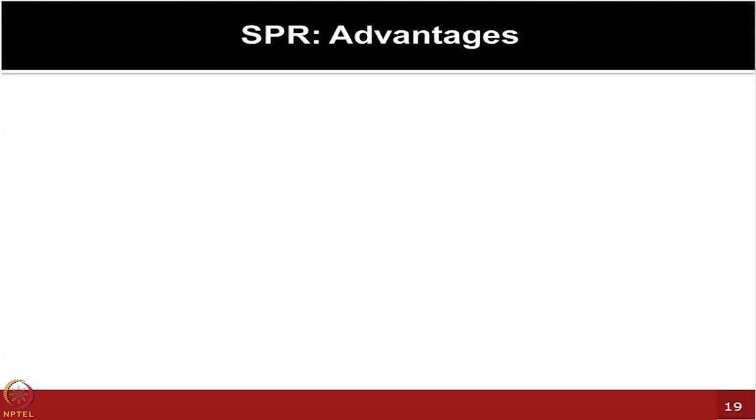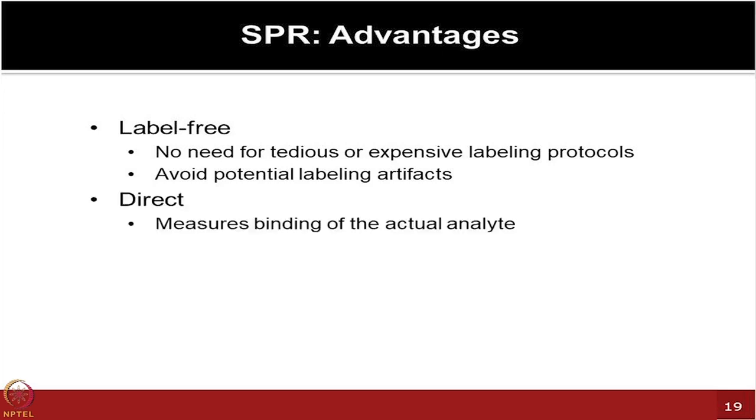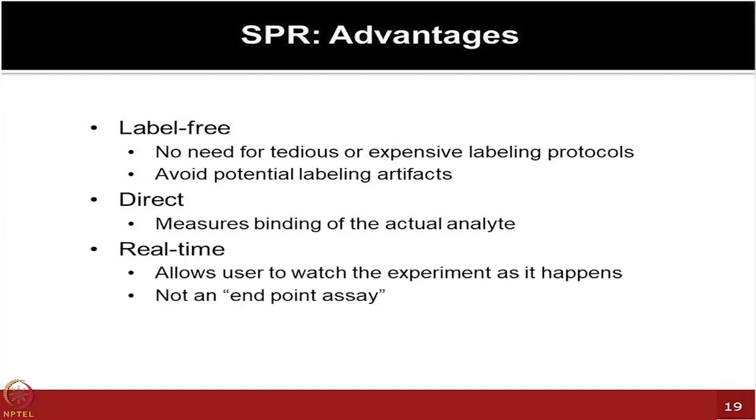So the advantage of SPR, I'm sure you are all convinced, is that you have a lot of promise here. You are not doing any extra thing on your molecules which you want to test for interaction, so there is no labeling which you are applying. You are directly measuring the biomolecular interactions using physical properties, and you have full control on how the reactions are progressing, so you can actually modulate the conditions to make it work.